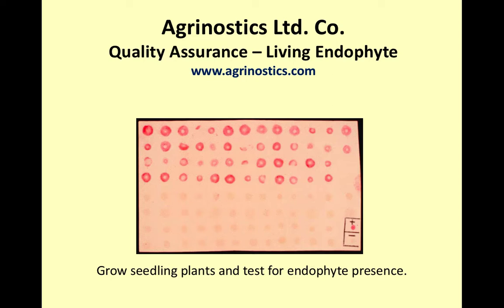And anytime you see pink like this, that means the endophyte is present. And down here you can see that there's no pink color. There's some discoloration there, but there's no pink color. Those are endophyte free. Okay, so we know there's endophyte in the seed. We know that there's endophyte present in the plants that we're growing in the greenhouse or we're testing for viability.